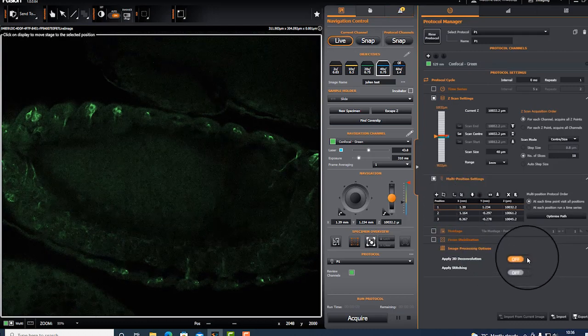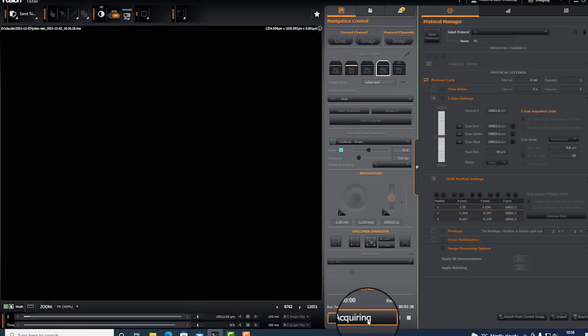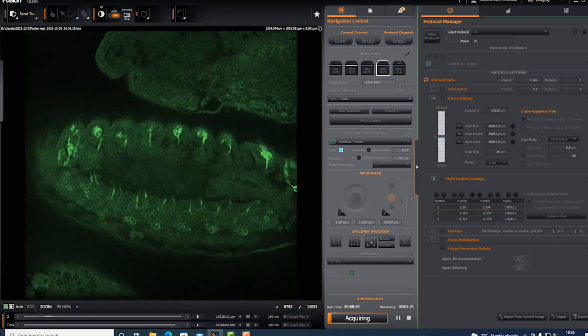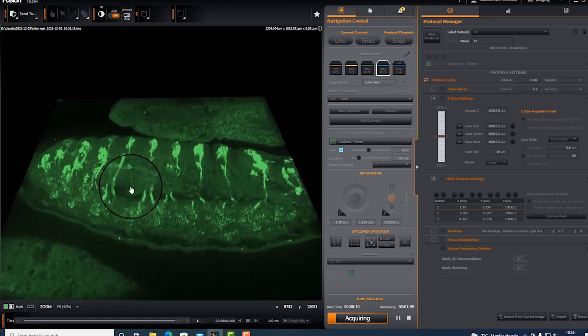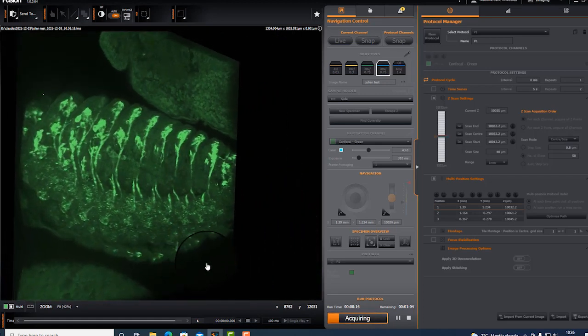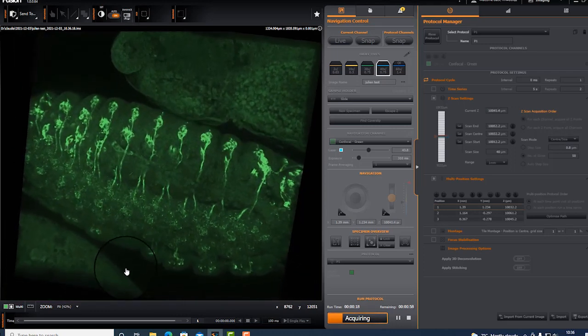You could also select to apply deconvolution. Press acquire, and all the 3 positions will quickly be acquired. You can visualize your stack being built. And this is quite useful because you can stop if your 3D doesn't look good.